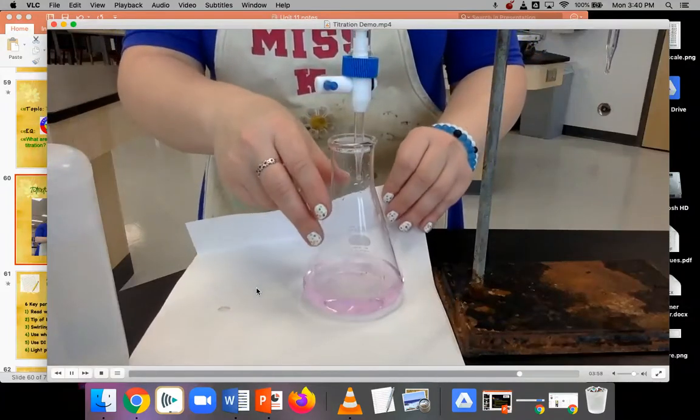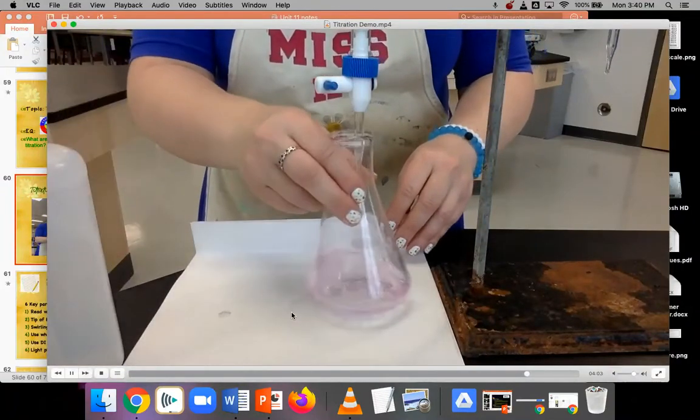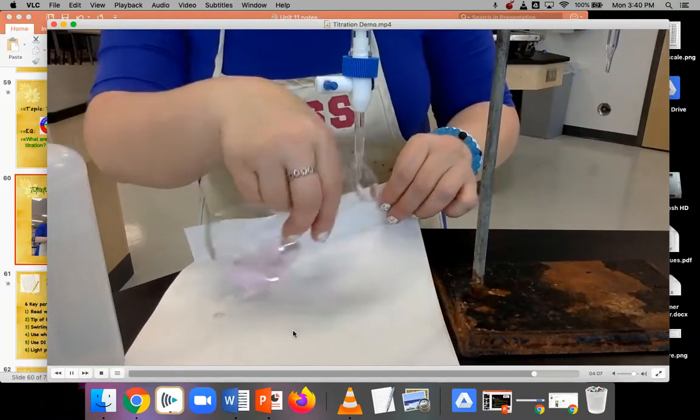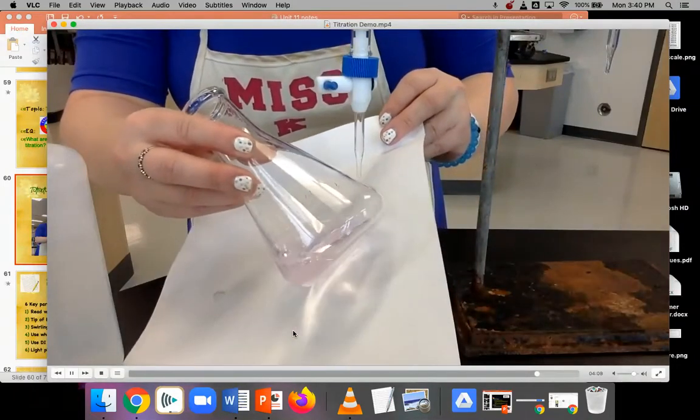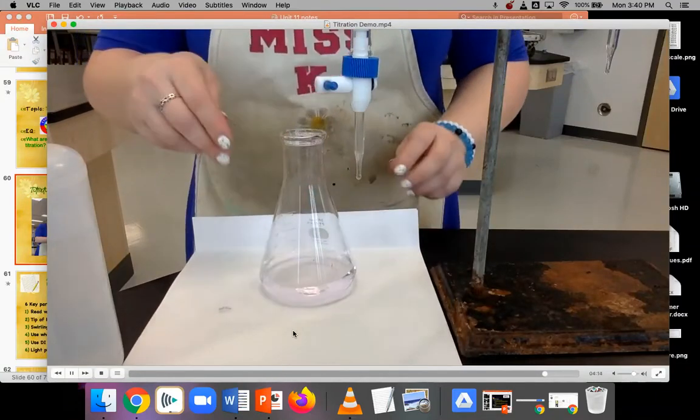There it is. There is my beautiful light pink endpoint. Compare it to the background of that white paper. See how light it is? Yay! That is a perfect light pink endpoint for phenolphthalein. Sodium hydroxide is my standard solution. HNO3 is my acid for this example.